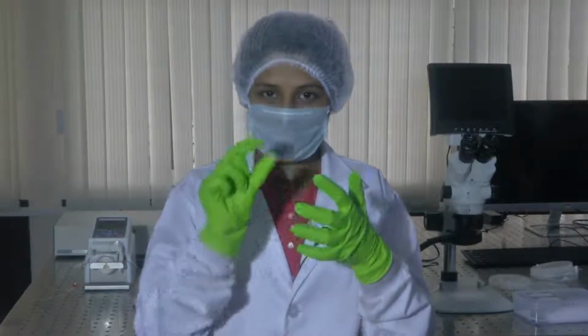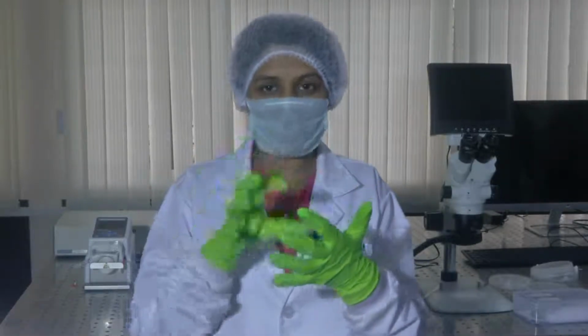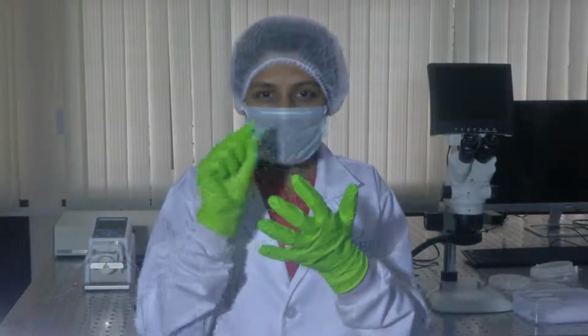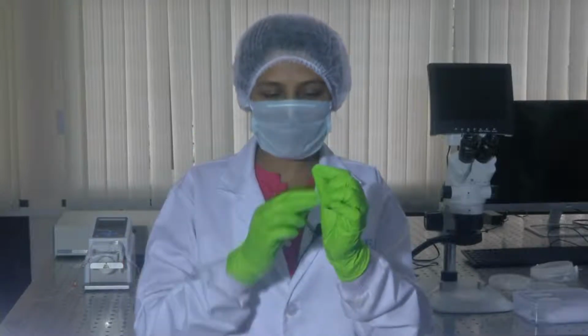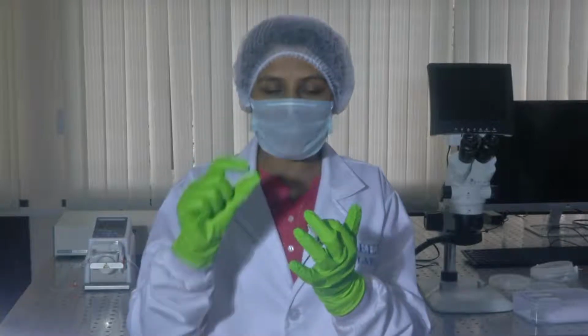The peristaltic pump has rollers on it, and there are reinforced tubes, which you could actually see. We will give you a demonstration on how these pumps are constructed and how they work. They employ rollers which squeeze through the tubes, and that's how the fluid flows, and you could get a fine control over the rate at which the fluid flows, and the volume of fluid which goes into your device could be controlled.